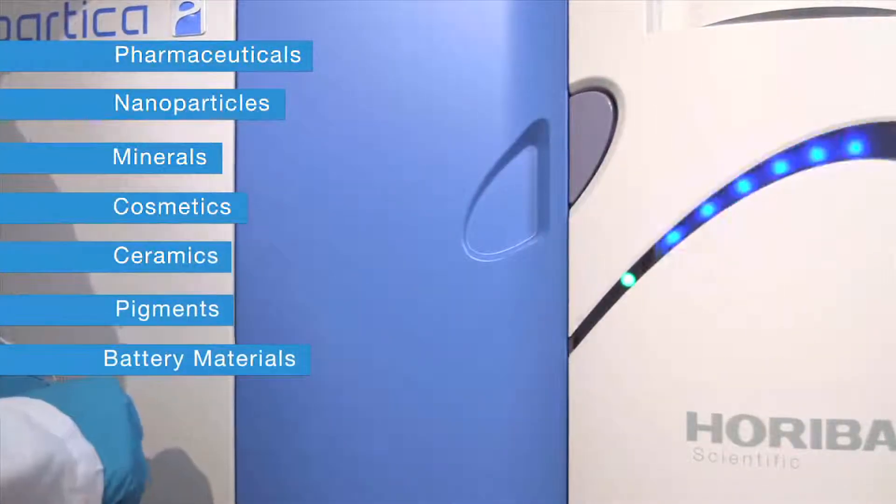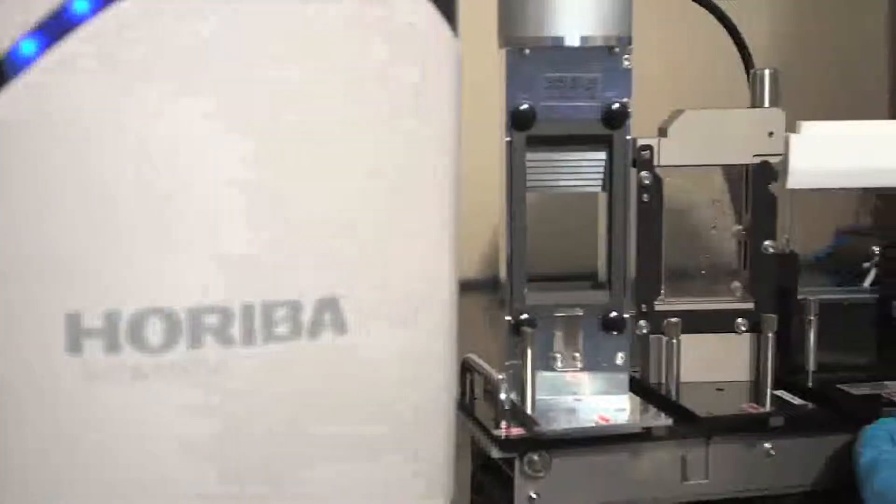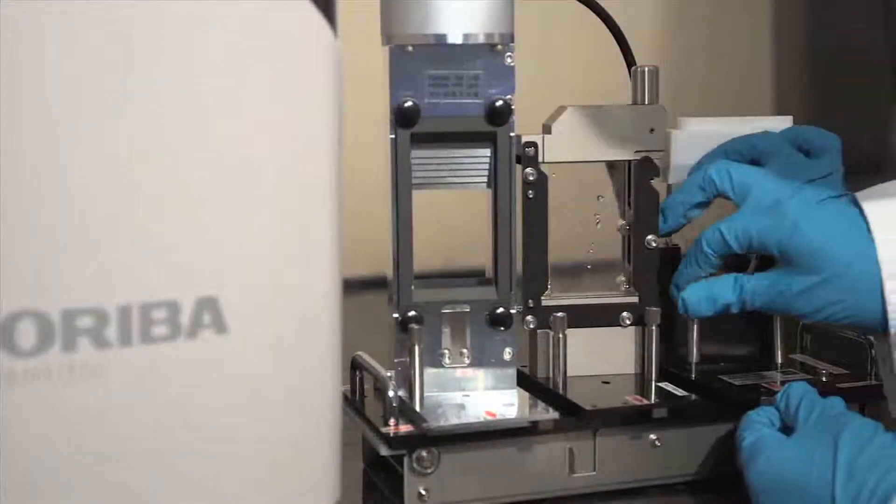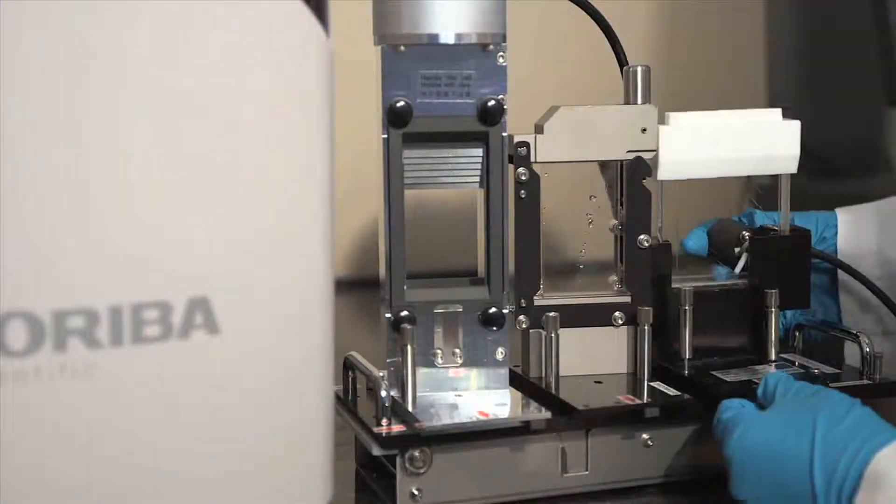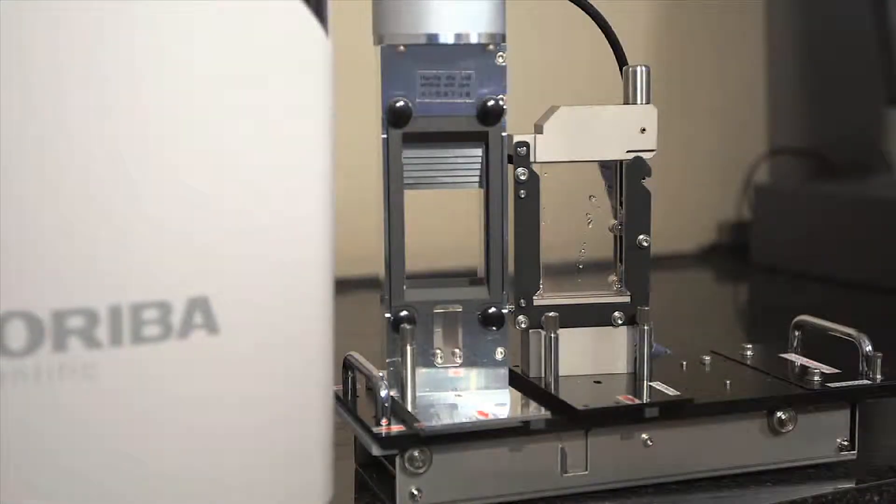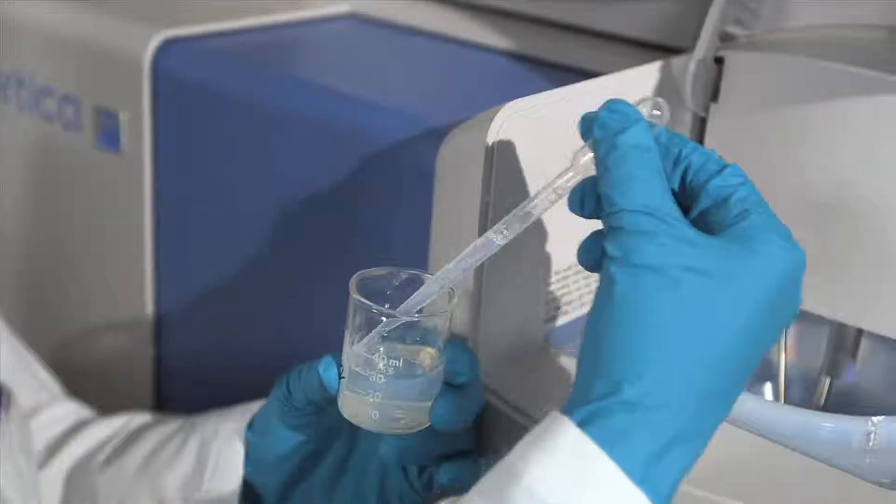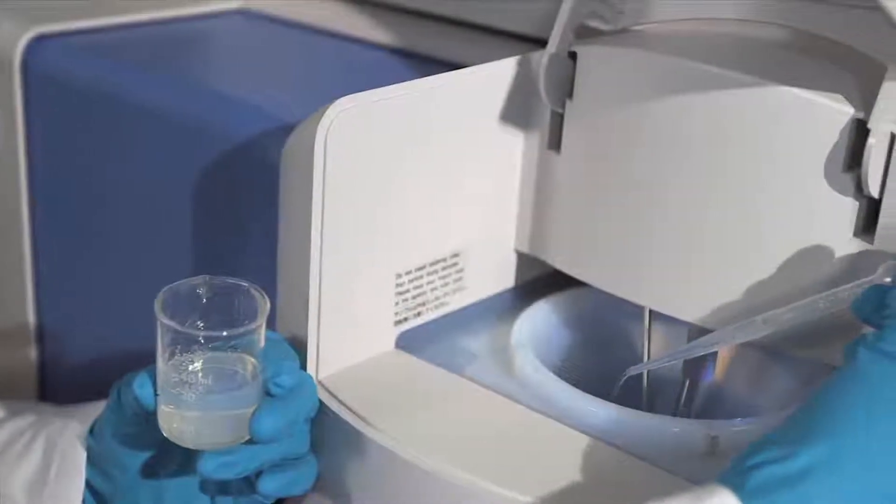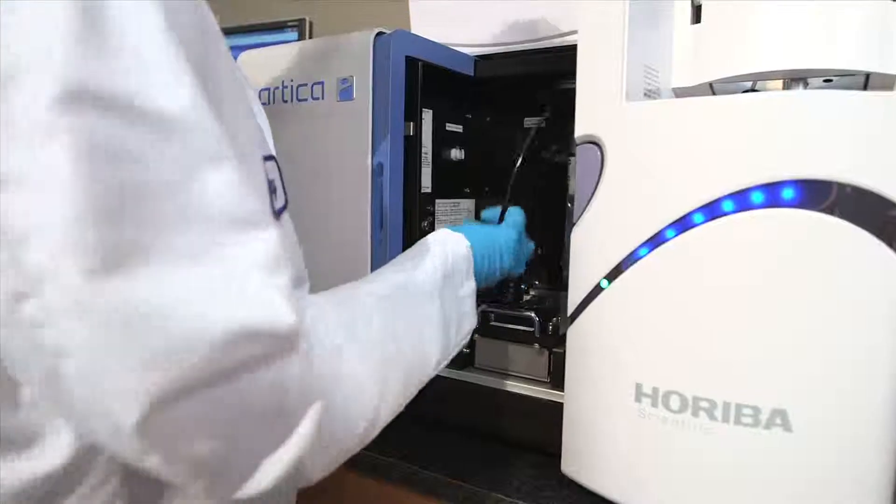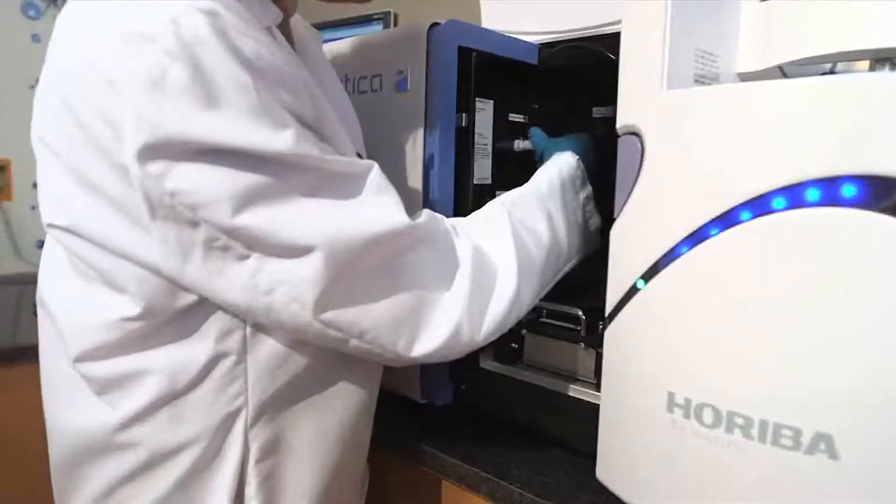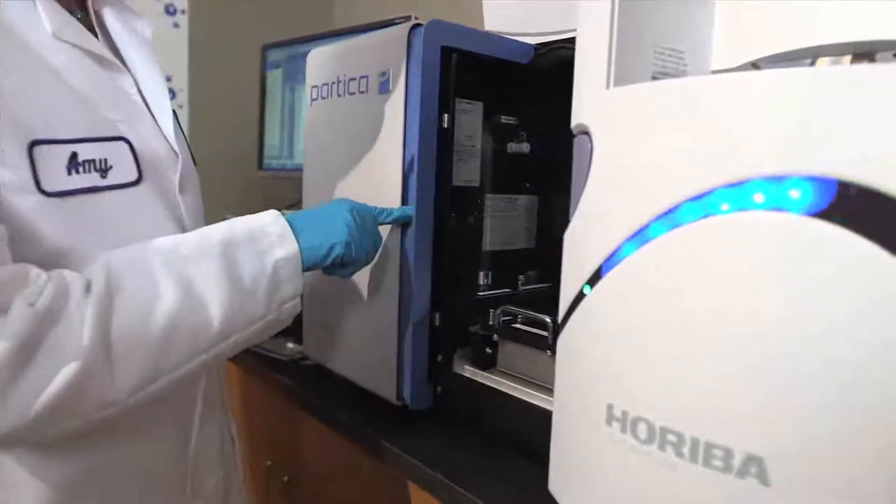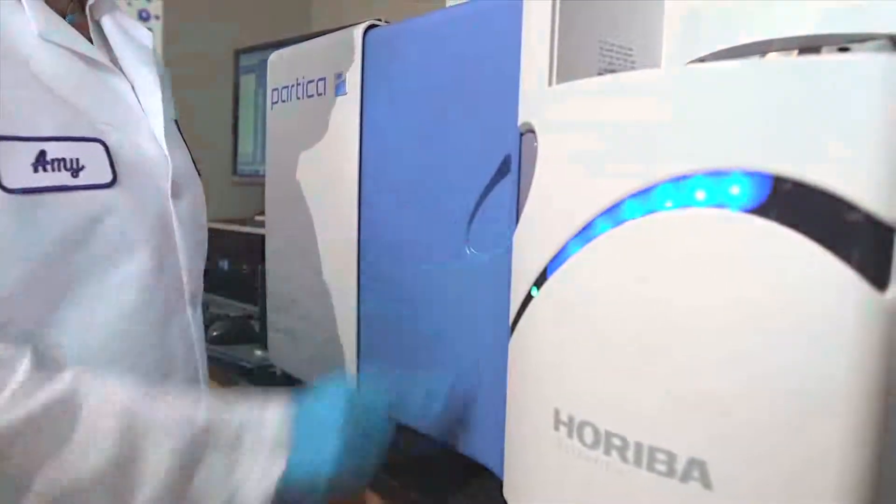The LA960 maintains the excellent build quality and reliability you expect from Horiba Scientific. Industry-best instrument-to-instrument agreement makes multiple operator or multiple location setups hassle-free. And with solid-state light sources and detectors, the LA960 is a tool designed to last.